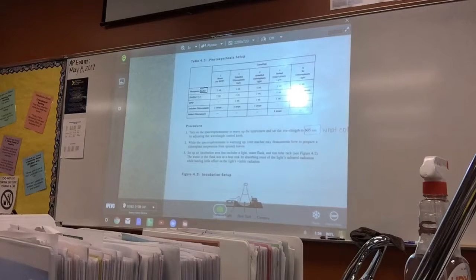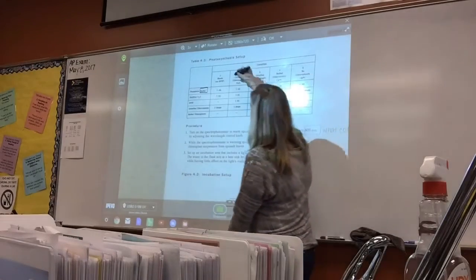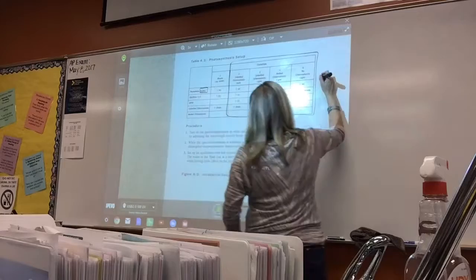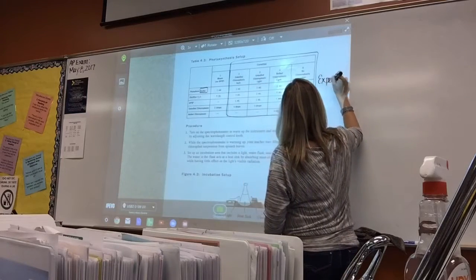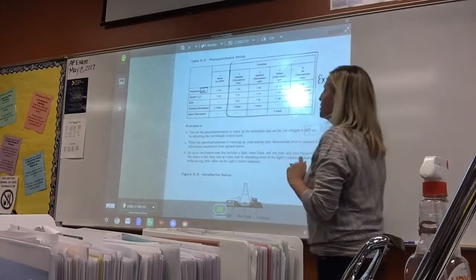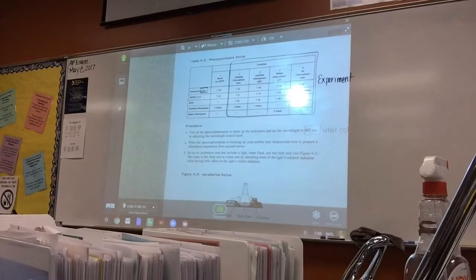And so that would be the blank. And so every other one, these guys right here, are actually part of the experiment. The only purpose of this one here, the blank, is to set the spectrophotometer. So let's talk about how we're going to tell if the DPIP goes from blue to colorless.